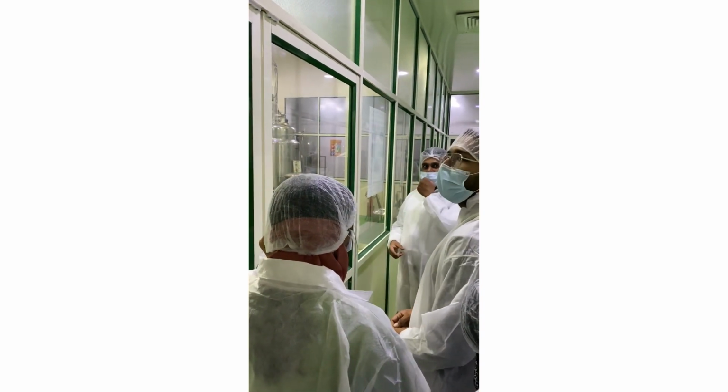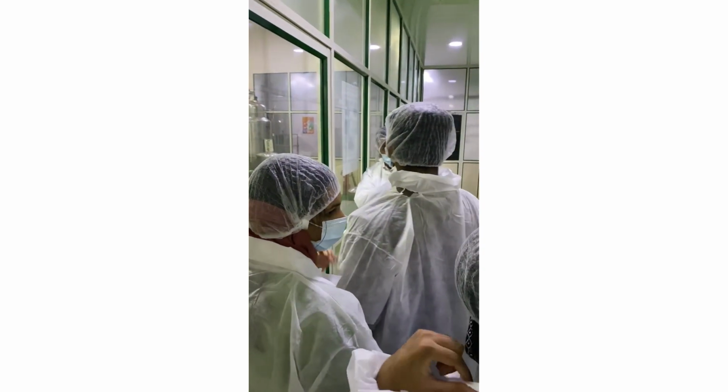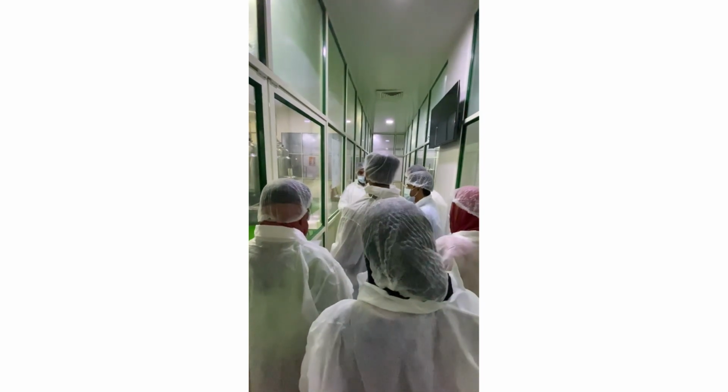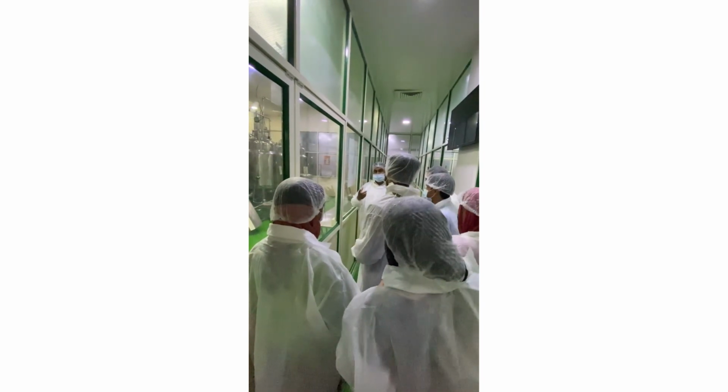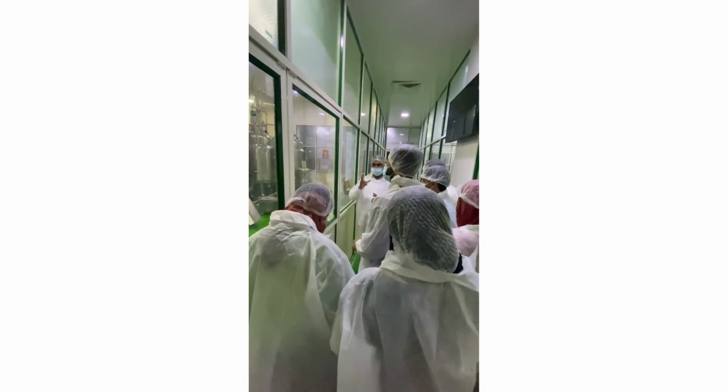Then we have pasteurization from here. Pasteurization is to kill the microorganisms. We heat the product so that the microorganisms are killed. So we have to ensure that.